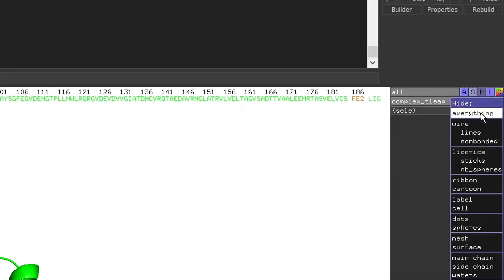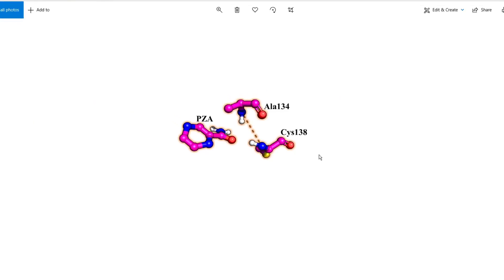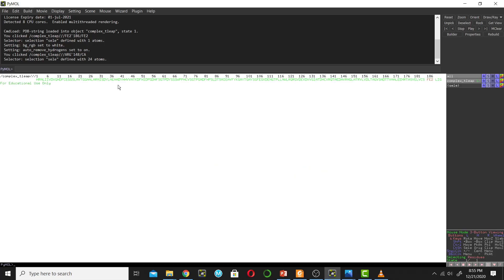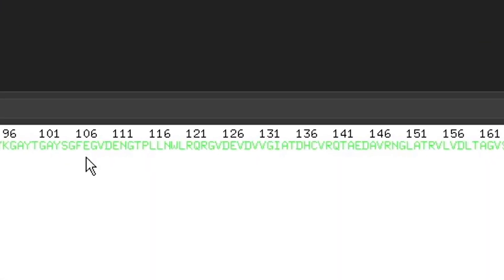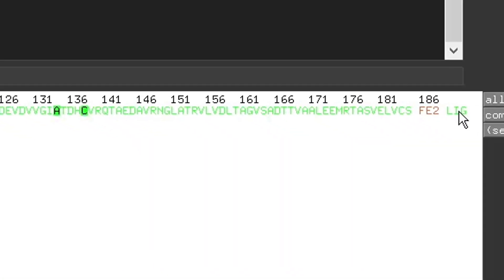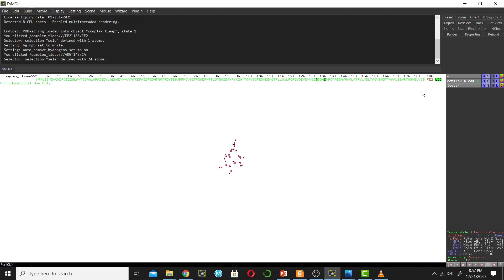Let's hide everything — go next to the complex and click Hide, then Everything. Now we will reproduce a reference image. In that image there are two residues: alanine 134 and cysteine 138, and a substrate PZA — all three shown in stick model. You can search for alanine 134 in the sequence panel to locate it, then find cysteine 138 similarly.